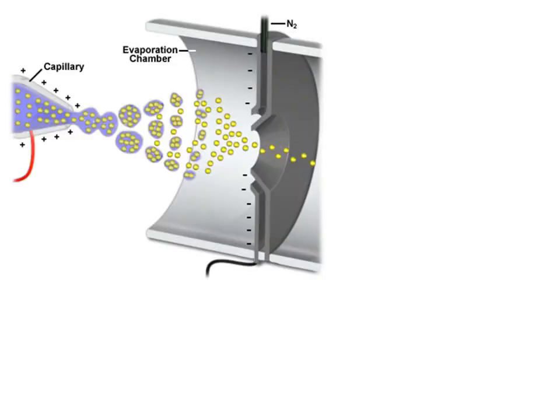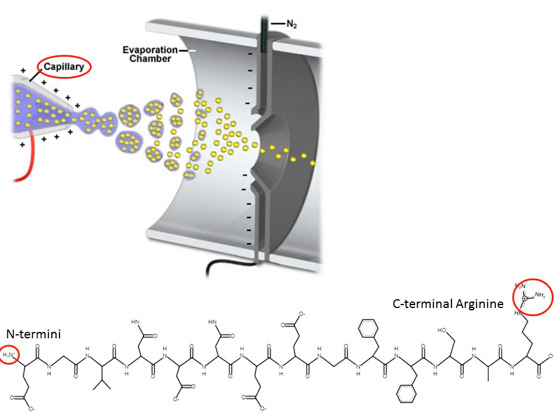The alternate form of ion source is electrospray, again invented in the 1980s by John Fenn. In electrospray, the peptide or protein is in a liquid that flows out of a capillary that is under high voltage, usually between 1500 and 5000 volts, depending on the flow rate of the liquid, with a lower flow requiring lower voltages. For peptides and proteins, the liquid is normally an acidified mixture of water and organic solvents such as acetonitrile. The acidic conditions means that there is an excess of hydrogen ions in solution, and the peptide molecules become protonated on their primary amines as previously described.